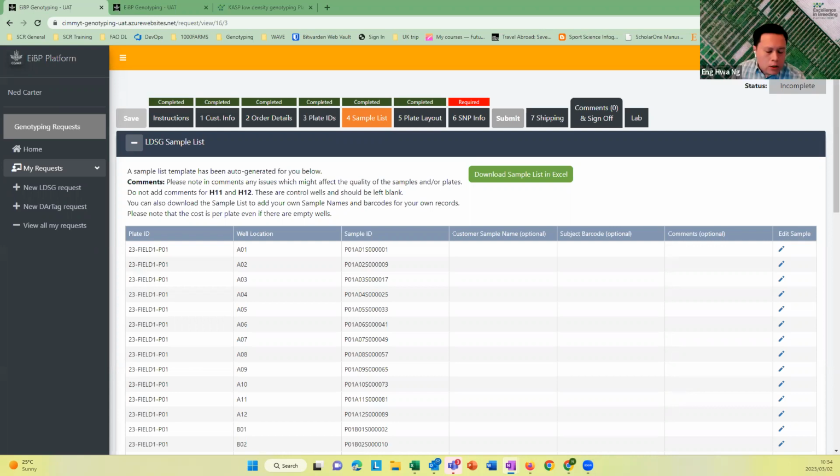Yep, and just to add to that, Jim, I know that for people in breeding programs already in some kind of database, it may seem like double work, which is why we're here to help you. If it's just a two-step merging process, and you can manage it for the next two to three jobs, I'm pretty sure we'll have a more elegant way to manage the merging in the coming months.